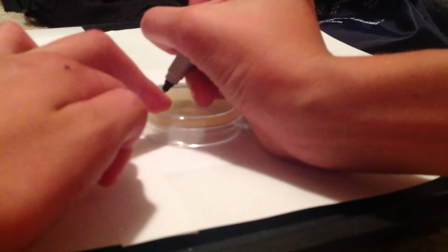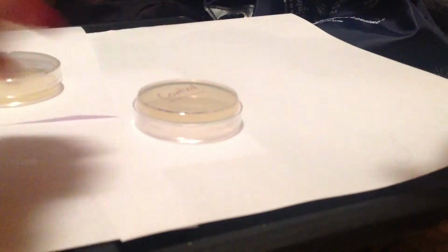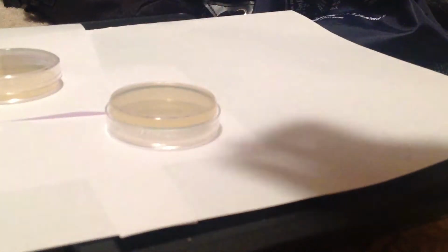Since every experiment has a control group, I included one as well to make my experiment a real one and not just pseudoscience. Even though I only did 2 trials, 2 petri dishes in each trial were the control group. The control was just a plain petri dish with nutrient agar, but no bacteria or hand sanitizer. It was necessary to include this to make sure nothing would grow on the agar, so my results would be valid. Even though it was the control, I still put it in the incubator with all the other petri dishes.